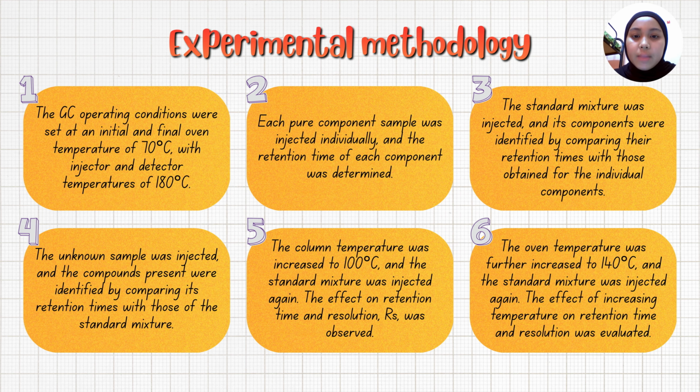Now I will explain the experimental methodology used in this gas chromatography experiment. First, the gas chromatograph was set up with an initial oven temperature of 70 degrees Celsius, while both the injector and detector temperature were maintained at 180 degrees Celsius.